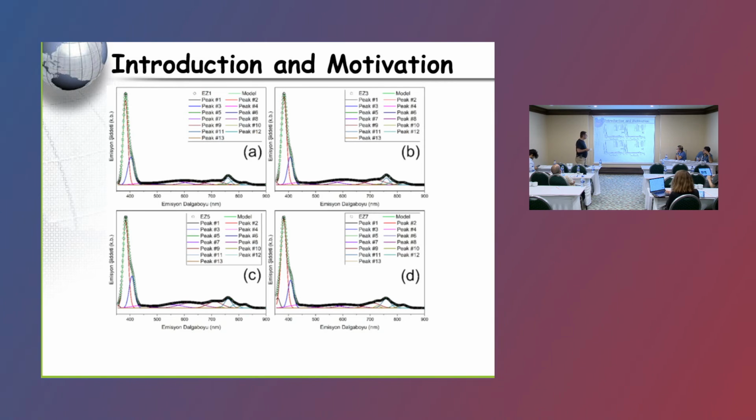Again, to understand the defects for the fabricated erbium doped nanorods, we again took PL measurements, and again we used the fitting program with Gaussian decomposition, and we found the defects.